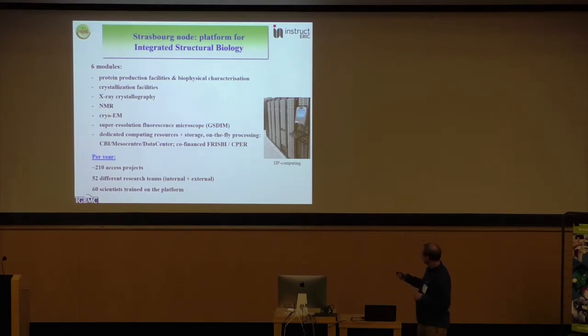Then super resolution setups with developments, I'll come to that later. And what is actually increasingly important is to have dedicated computing support, including on-the-fly processing. So with that, as a site here, we have over 200 access projects per year, with over 50 different research teams inside and outside combined.